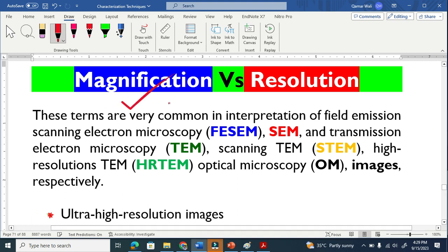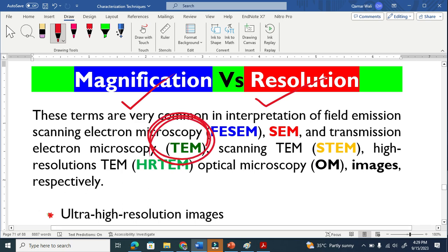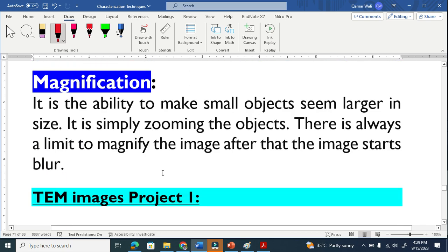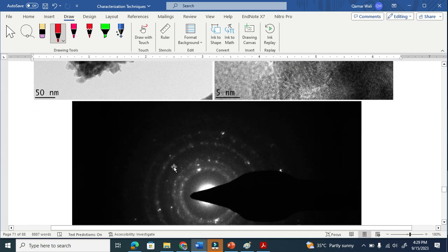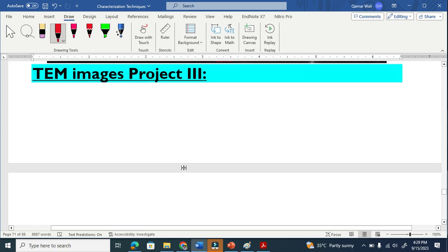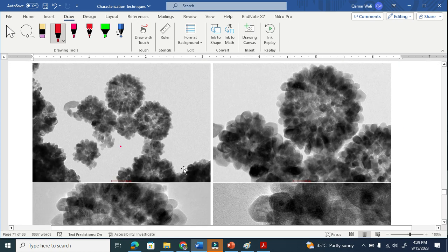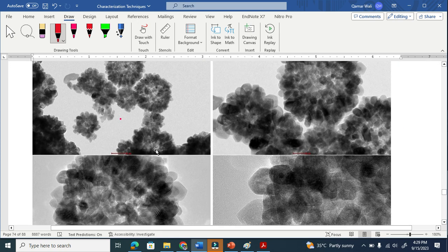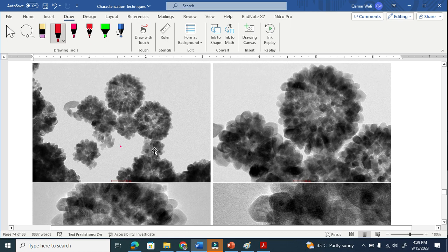Let us differentiate between magnification and resolution with the help of transmission electron microscopy images. Here I have three sets of transmission electron microscopy images, and I will make it very clear what the differences are between magnification and resolution.